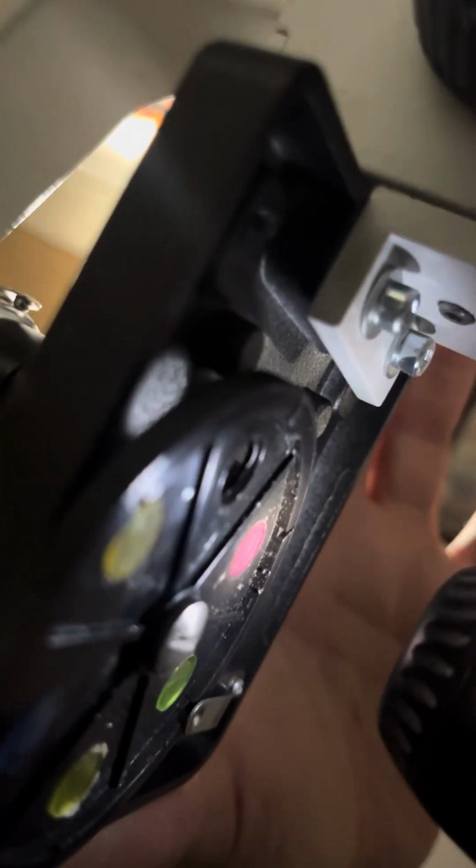Something is not perfectly fine with the way that it's aligned. Just a second, the table of the microscope required a little bit of adjustment. Okay, it's better now.